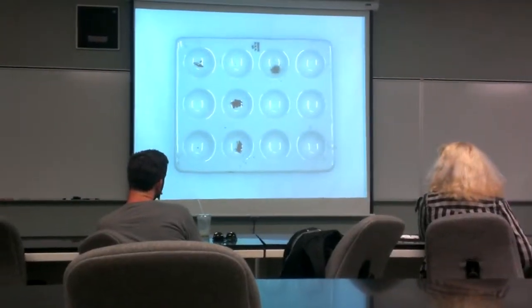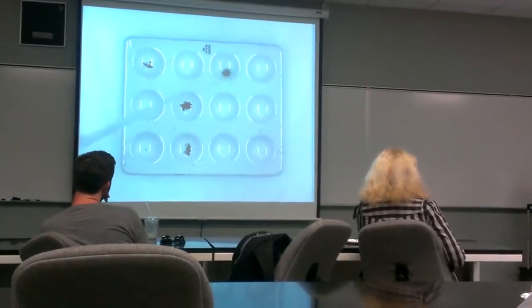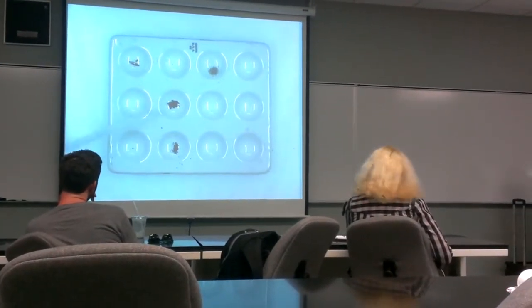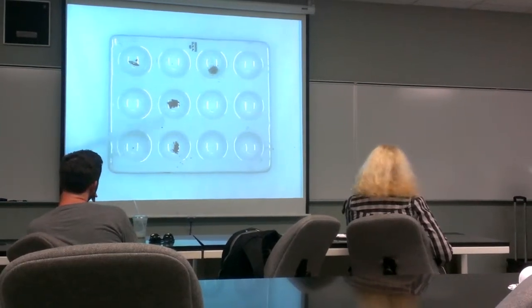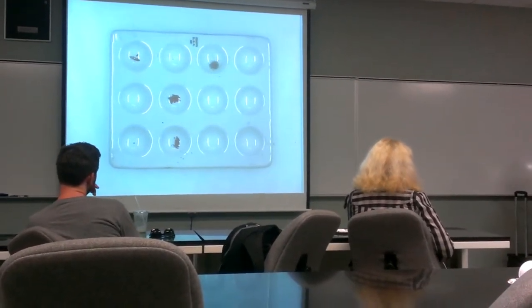I've placed some samples in it. Let me tell you about the samples. I have three different types of samples. I have what is a known meteorite. I have what I think is meteorite dust. I think that's Gibeon. And I have two samples of an unknown that we're testing to see if it's a meteorite or not. And this is a chemistry type of test.